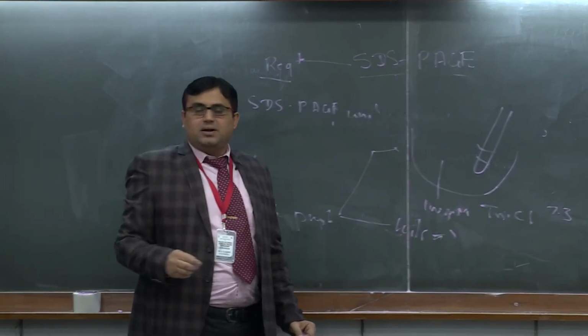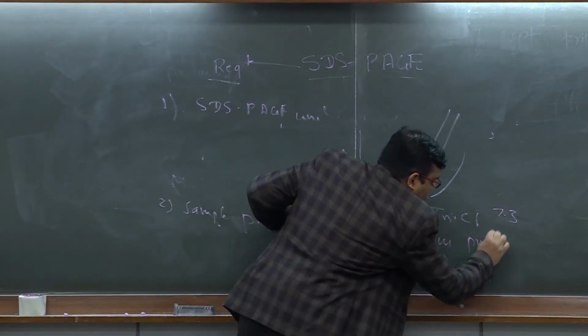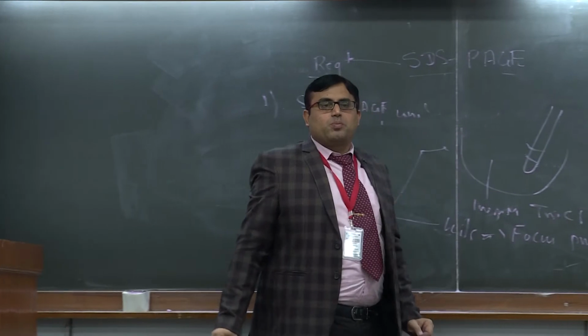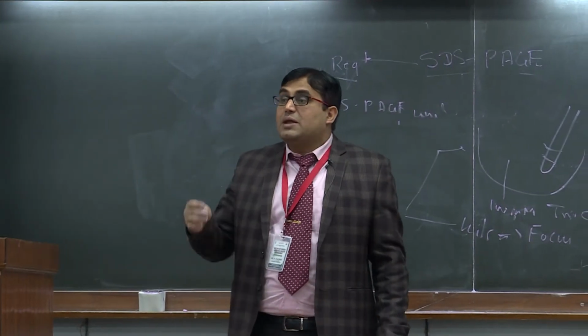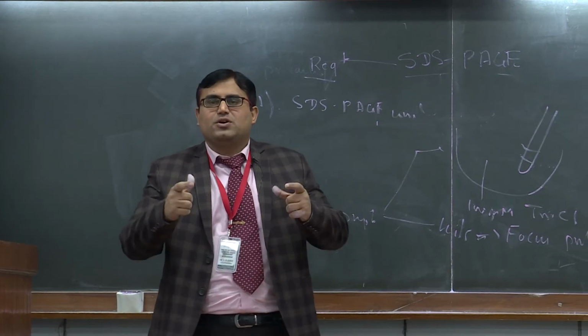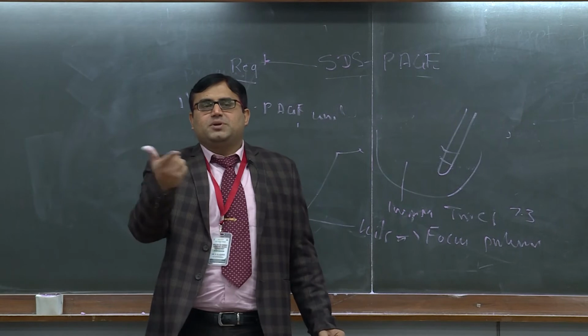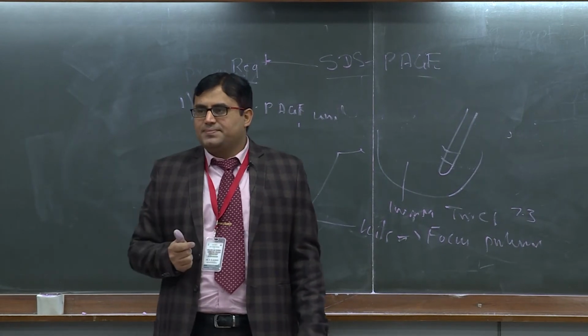Like we have a Focus proteome kit. This is proprietary of G Bioscience. The beauty is you can extract as well as purify the protein. You can remove all the contaminants. And this is very easy, within 10 minutes you can do it. This is a column based method.